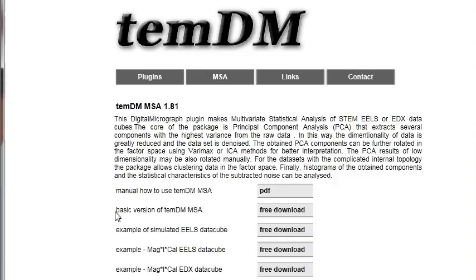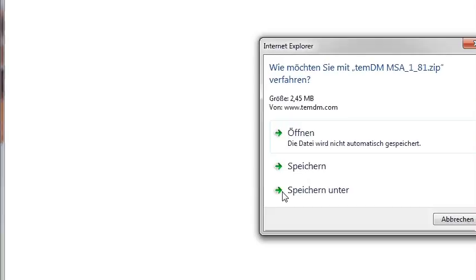We need the basic version of TEMDM MSA package. Just click free download and save.